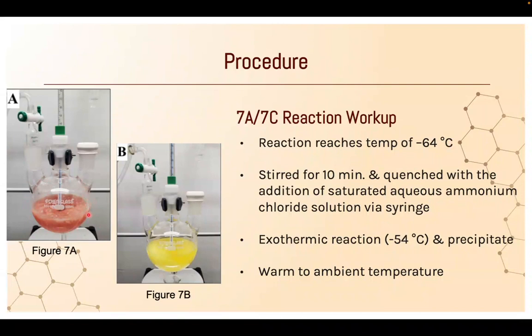The reaction is then warmed to ambient temperature for about an hour, at which point the reaction mixture turns a bright yellow color with precipitate still being present, as can be seen in figure 7b. Over here, the bright yellow color of the reaction after it's warmed.